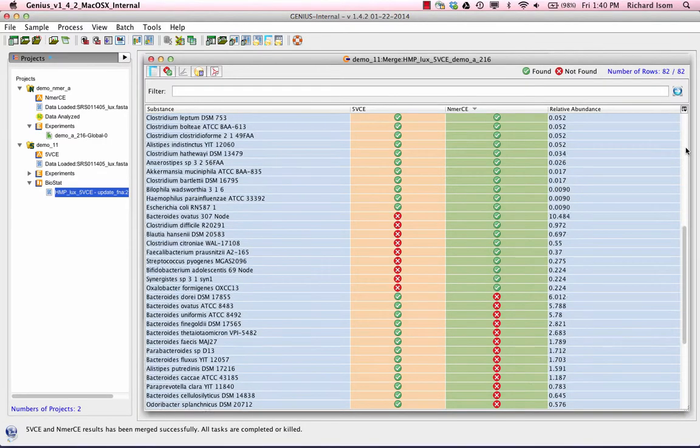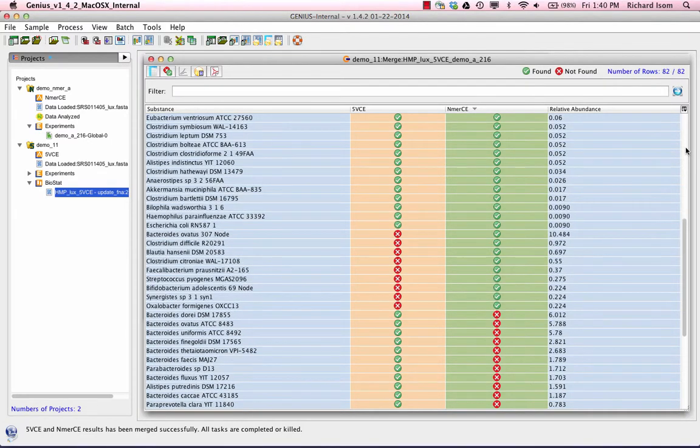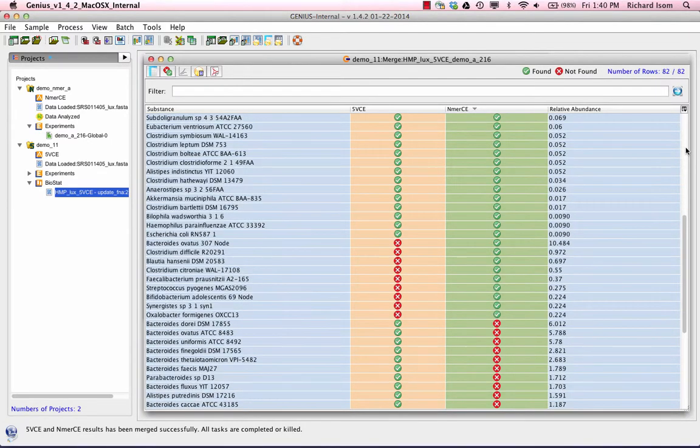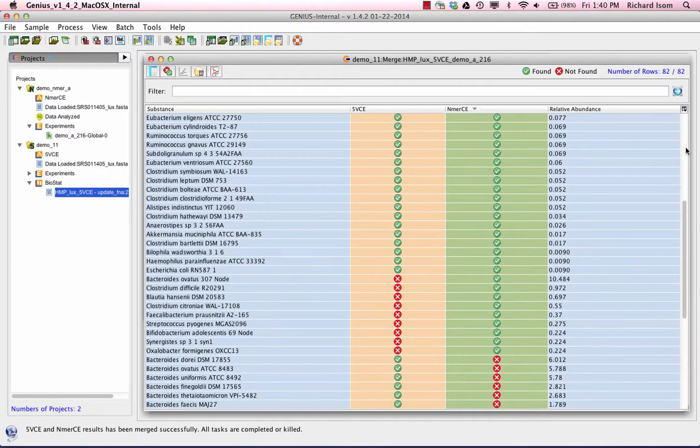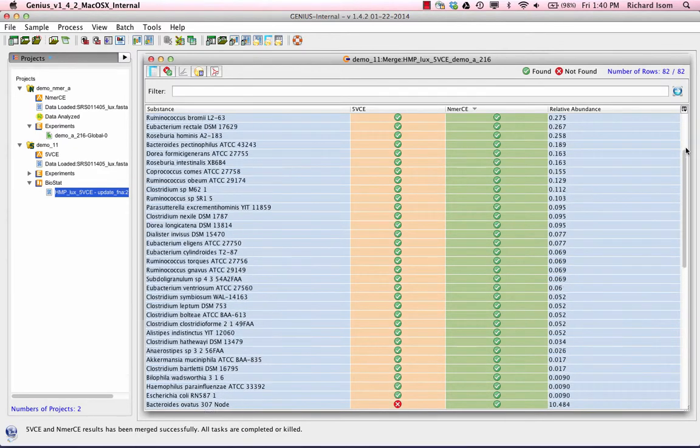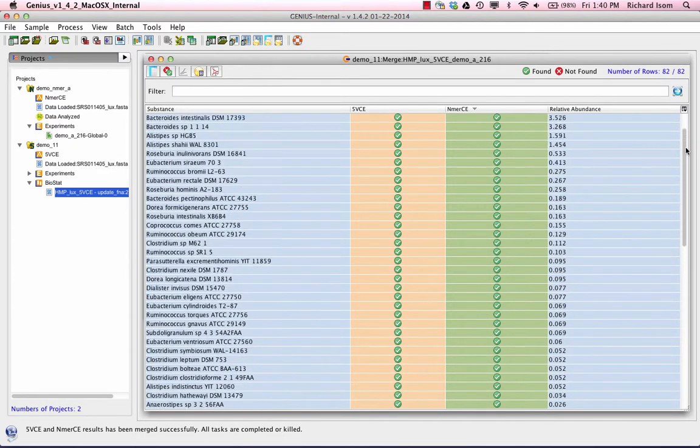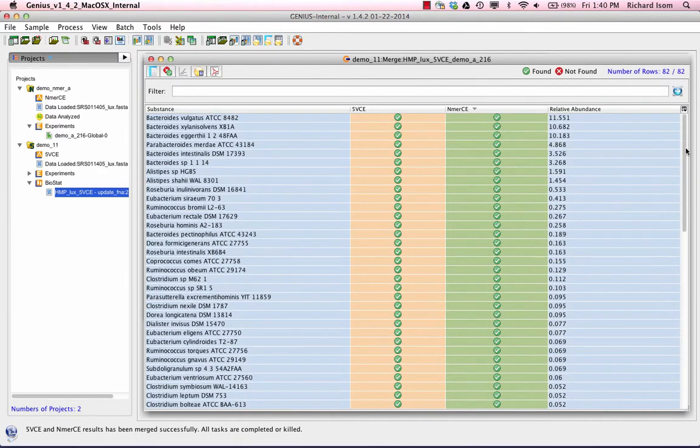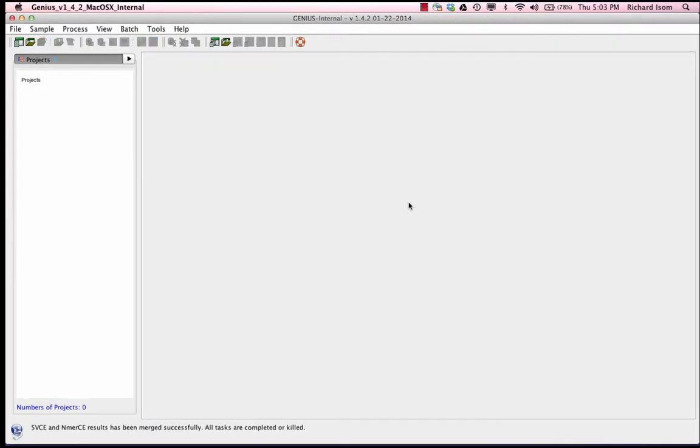In any identification method, there is always a trade-off between sensitivity and specificity. In Genius, by combining the results from two independent analyses, we improve the sensitivity of detection without compromising the specificity.